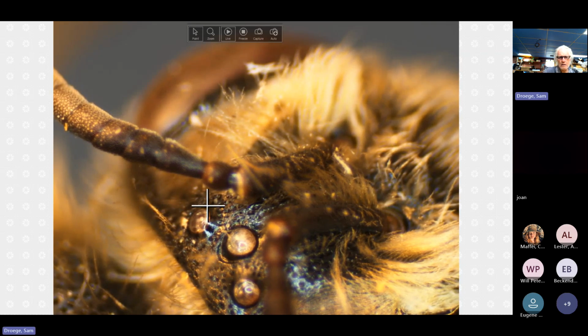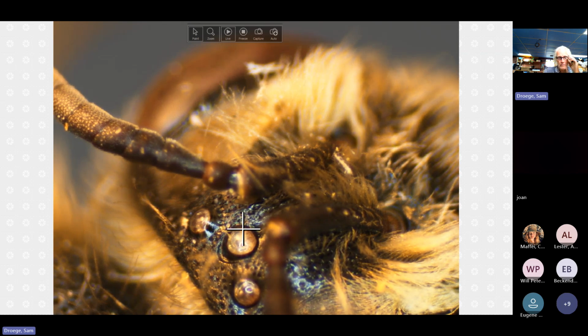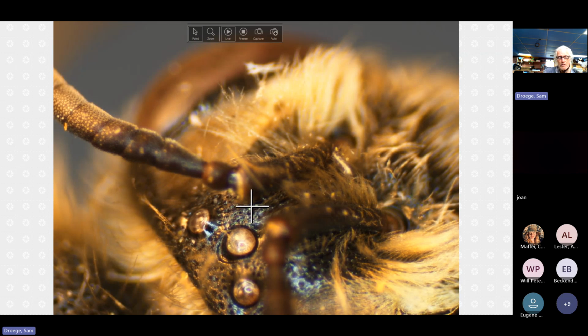But, and again, I'll point this out several times because it is an important key character and is one of those things that you know it when you see it. But a lot of times if you don't see a Hippodes or its other species counterpart whose name I forget, you tend to try and make some of the ones that don't have glossy areas into it.